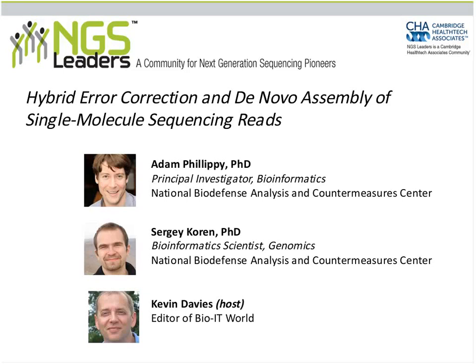But a recent paper published in Nature Biotechnology described a correction algorithm that has been developed to address that problem. The authors were able to marry the long but slightly error-prone single molecule reads from Pacific Biosciences with the highly abundant and relatively high quality but short read lengths from the Illumina HiSeq instrument.